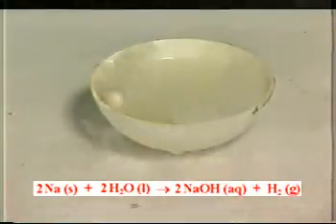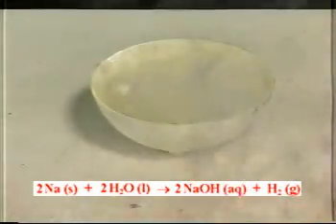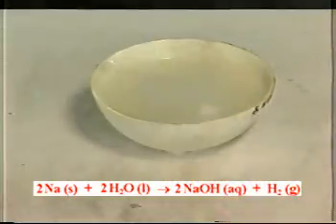Okay, so notice that the reaction is essentially the same. We've just replaced lithium with sodium. It's now sodium plus water makes sodium hydroxide plus hydrogen. But notice the difference. The reaction's a lot more violent. It gets even more violent now.